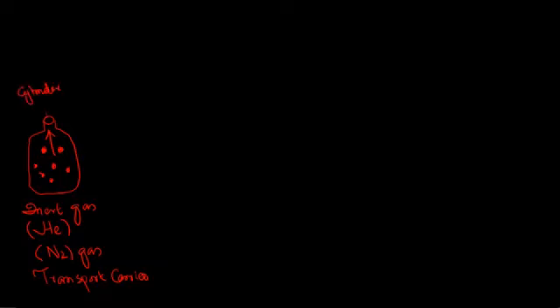The cylinder is connected with the part of a gas chromatograph known as the gas flow controller. The gas flow controller is a device which controls the flow of the amount of the inert gas in a gas chromatograph.